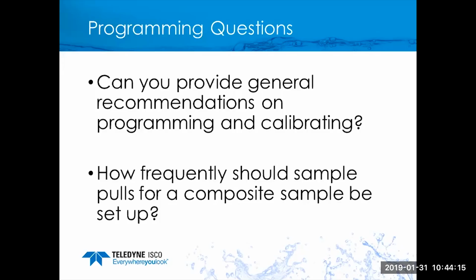Question: how frequently should sample pulls for a composite sample be set up? Well, again, there's a measure of user choice here, as well as whatever is dictated by the edicts that have generated the need to collect samples in the first place. But in general, my rule of thumb falls back to every 15 minutes for time-paced, which equates to 96 samples over the day.